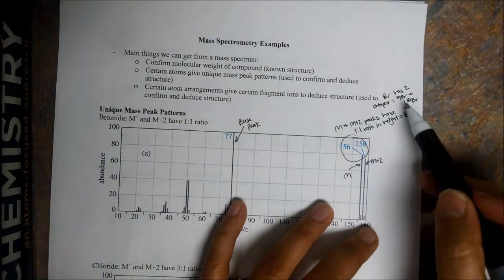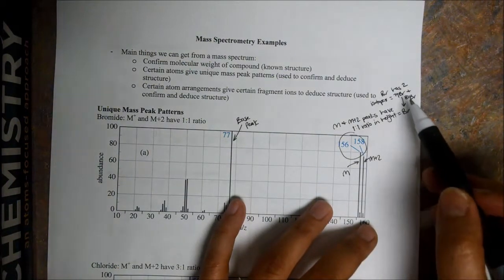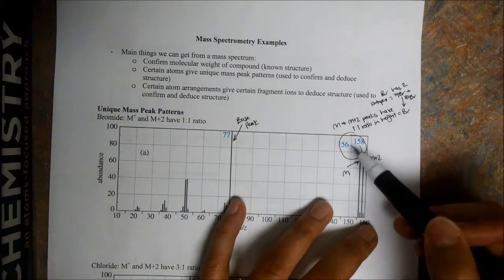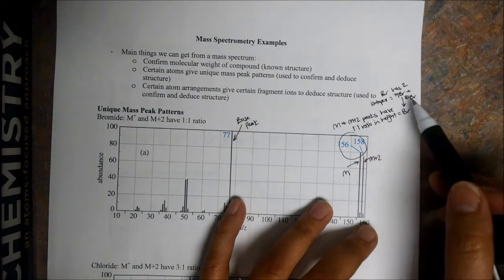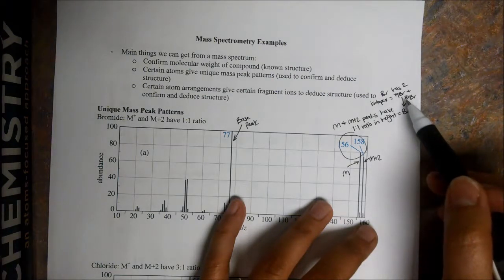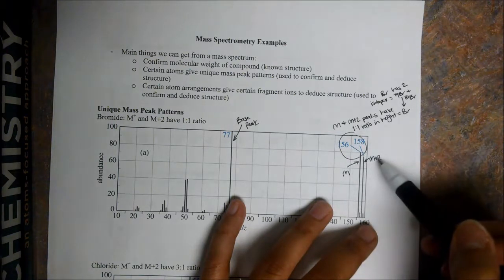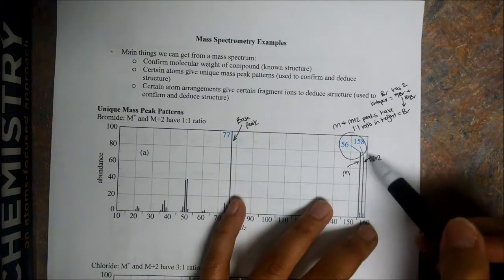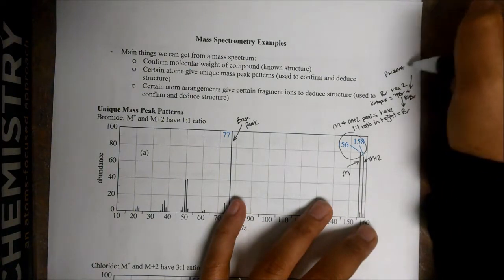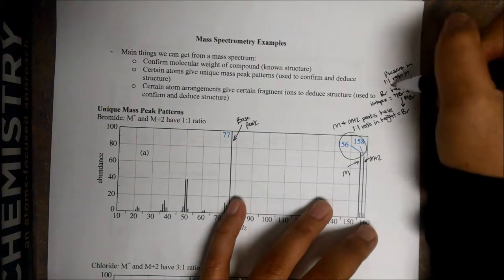Can anyone guess what their natural abundance is in the world? Maybe about 50-50. Okay, so if our molecule has this bromide, it's going to correspond to this mass, whereas if it has the heavier bromide, it's going to correspond to this mass. Okay, right? So they differ by 2 mass units here, and that's why we get a 2 mass unit difference between our molecular ion and our M plus 2 ion, and that's why they're also a 1-to-1, because these guys are present in a 1-to-1 ratio in nature.